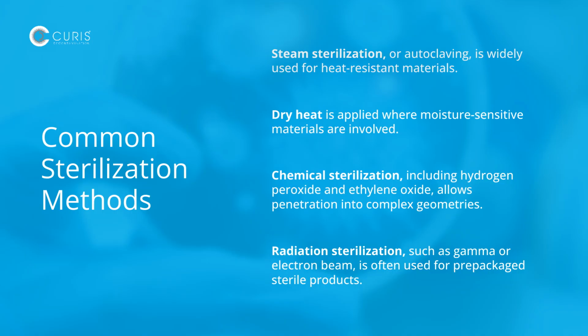Each method must be precisely validated, meeting defined parameters for time, temperature, dose, and distribution, using biological indicators and sterility testing to ensure effectiveness without damaging materials.